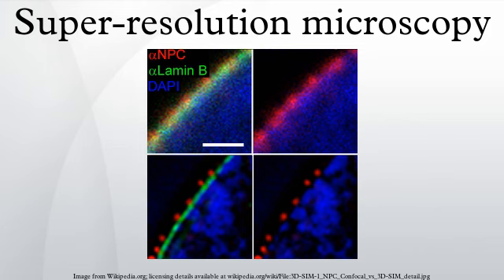Near-field scanning optical microscopy forces light through the tiny tip of a pulled fiber, and the aperture can be on the order of tens of nanometers. When the tip is brought to nanometers away from a molecule, the resolution is limited not by diffraction but by the size of the tip aperture. An image can be built by a raster scan of the tip over the surface. The main downside to NSOM is the limited number of photons you can force out a tiny tip, and the minuscule collection efficiency. Other techniques such as ANSOM try to avoid this drawback.